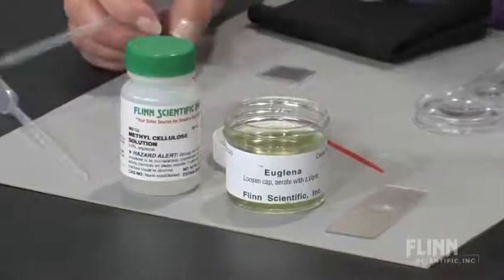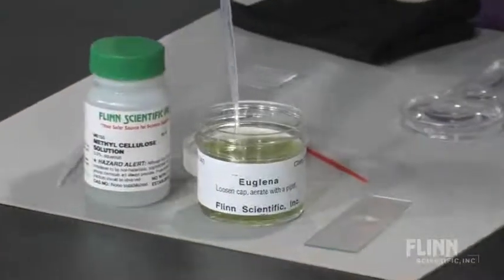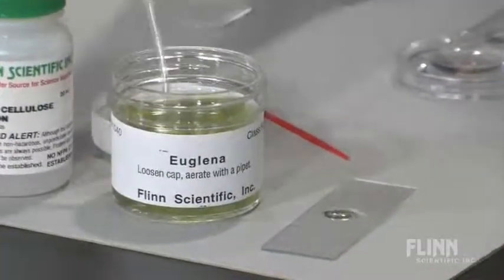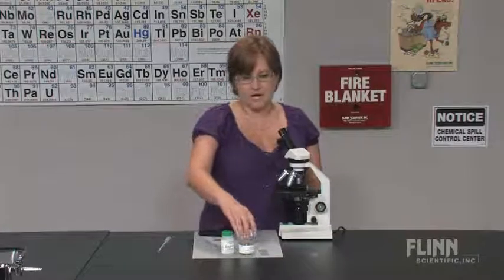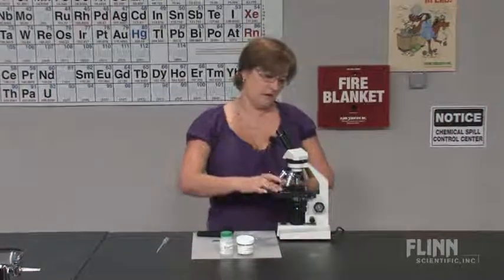The great thing about euglena is they are floating everywhere in the culture container, so you can actually just simply stir and take a sample. Put a couple drops on your well slide. No cover slip is necessary as that blocks oxygen. And look into the culture.